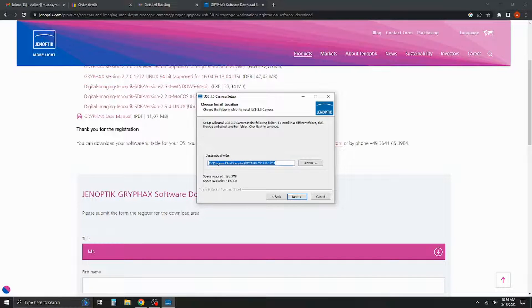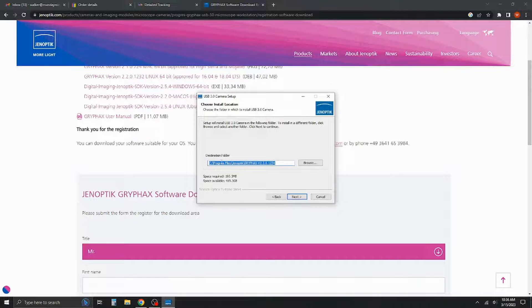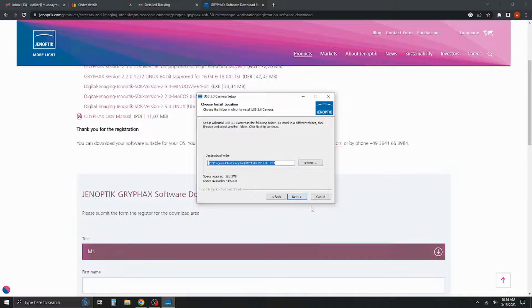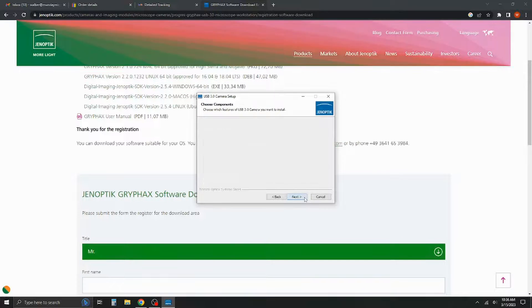We usually leave this as the default folder location, so just program files Genoptics as it should be. If you want to change that, you can hit browse and change where this goes. But we just let it install in the default location.